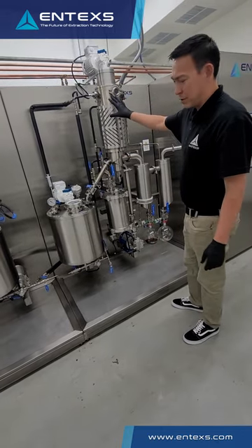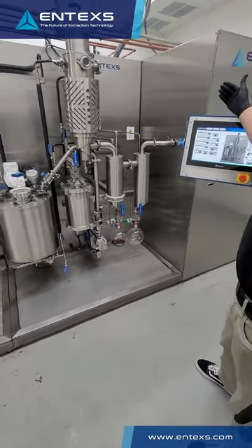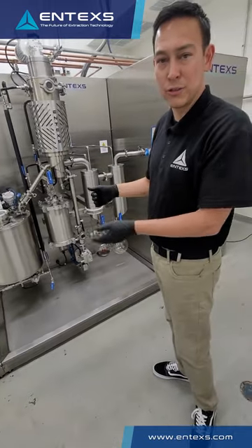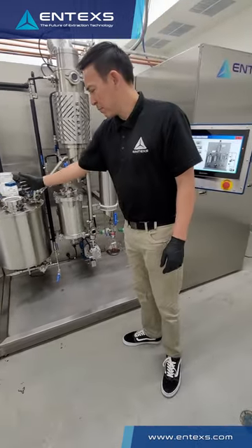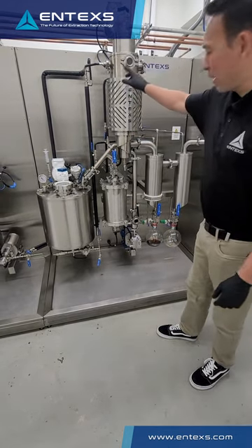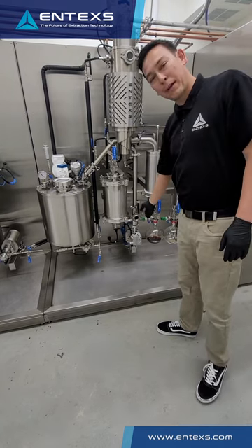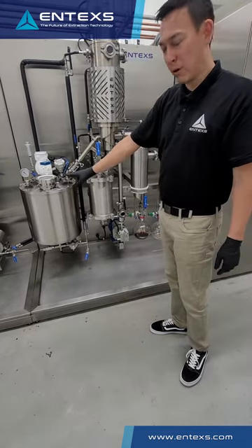Once that product is set over to a first-pass condition, everything is controlled from the HMI. We can set the first-pass conditions of lower vacuum and lower temperatures before going to the second-pass conditions of very high vacuum using our diffusion pump and high vacuum pumping system, cold traps, and thermal loops. As product is pumped from our wiped film feed stirred reactor, it comes into the wiped film evaporator. This separates your residue and condenses your distillate in the inner condenser, which we pump out of the process. This allows you to continually produce and pump distillate while running the tank down.